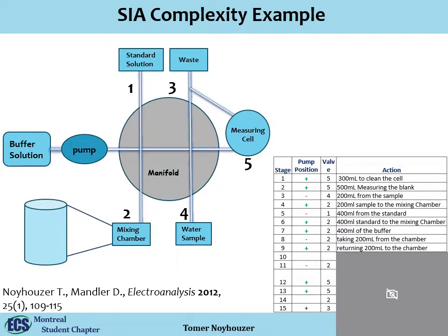And I wanted to show you a sequential injection analysis protocol that I used in the Hydronet project, just to show you the way you need to think if you're using sequential injection analysis. I told you, it gives you more flexibility, but it also adds more complexity to your system. But let's look at the different processes and how you need to look at the system. Here are the commands that I'm performing, and you'll see it in the drawing.